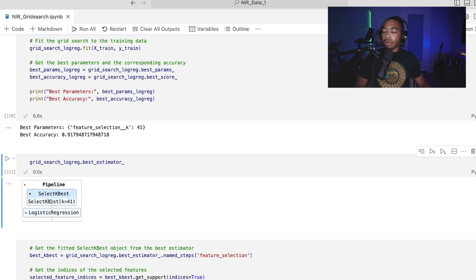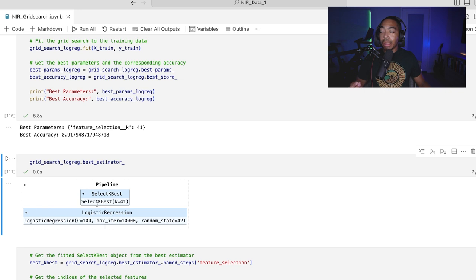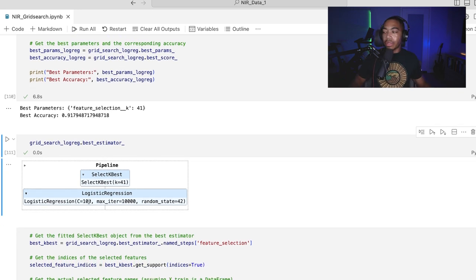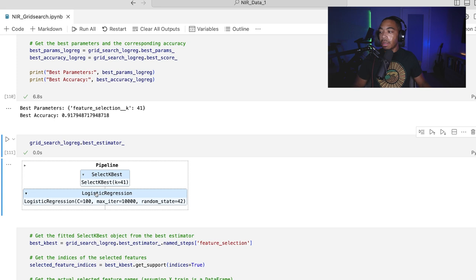And we will get this visual here where we can see we have our select k as k equals 41, the logistic regression with all the parameters I've instantiated in the beginning. But of course, we can search all of these parameters in the pipeline or even add new steps.